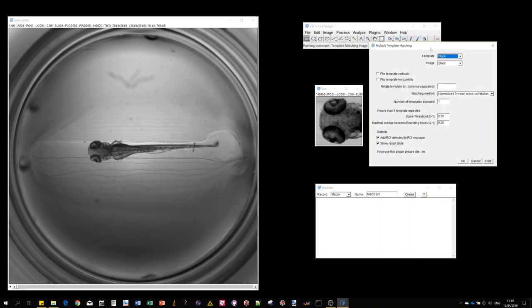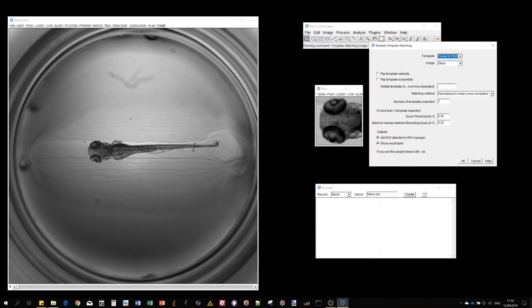The first field to fill in is the template - the small image that we want to find in a larger image. The second is the image, which can be a single channel grayscale, an RGB image (internally converted to grayscale since template matching is only defined for grayscale), or a stack where all slices would be analyzed.